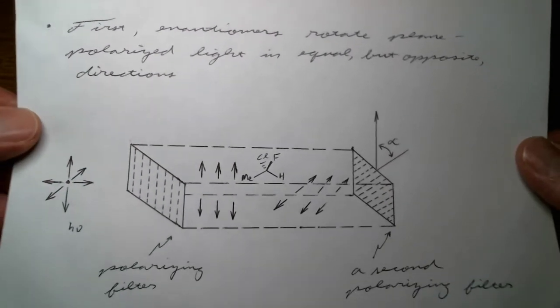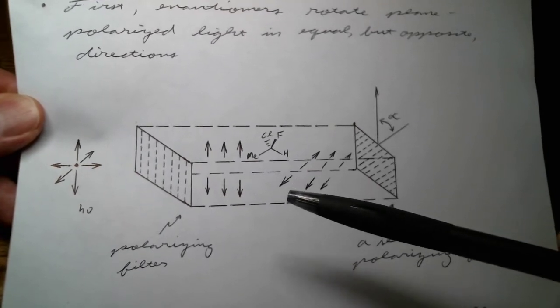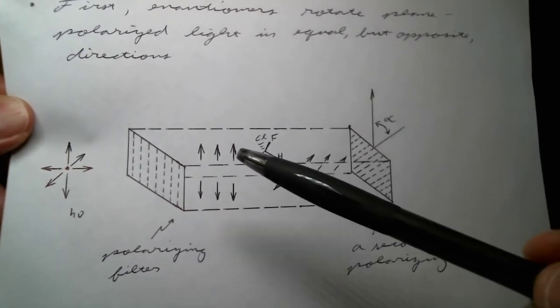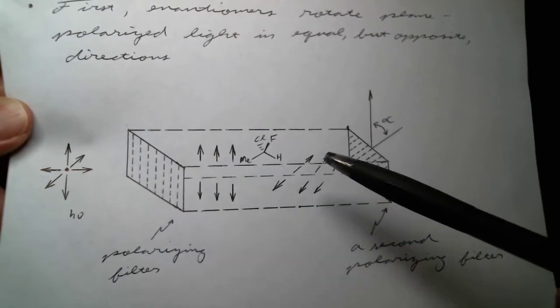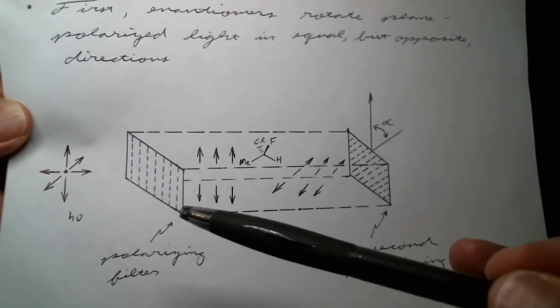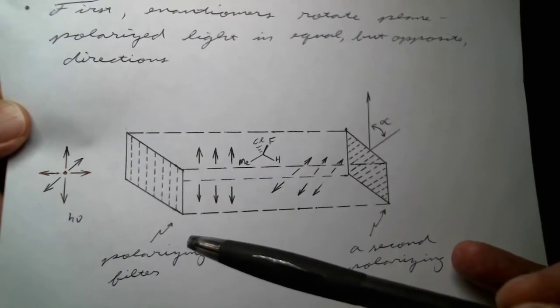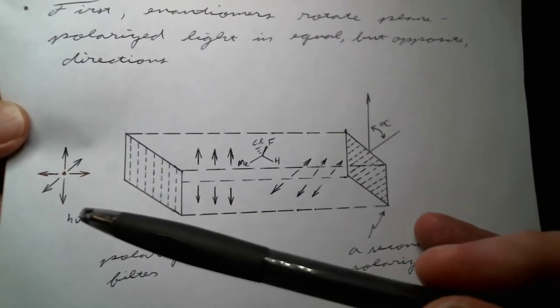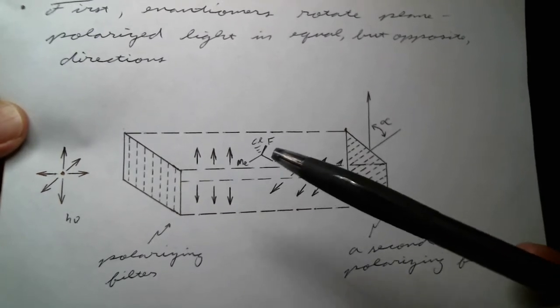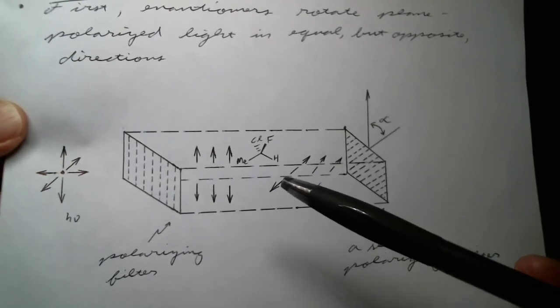So what do I mean by that? Let's pretend we have a solution, some sort of achiral solvent used to dissolve a chiral molecule, and we put it in a cuvette of some sort with a defined length. At one end of the cuvette, we have a polarizing filter. Light vibrates in all sorts of different directions, but our polarizing filter creates something called plane polarized light. So it only lets the light that's vibrating in the correct direction pass through it. As it passes through the solution, our chiral molecule starts rotating that light. So it interacts with the light and the light gets rotated.